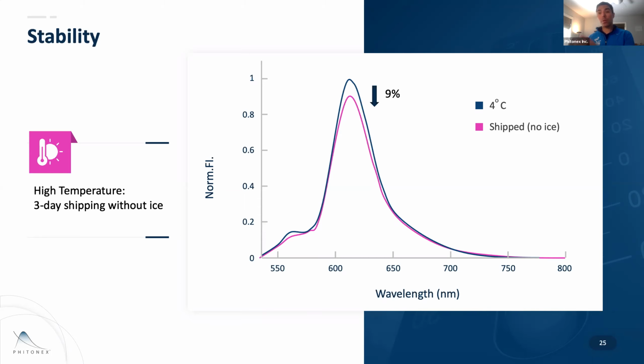And then the third was people running longitudinal studies, really wanting to say, how consistent is this over time? What does that mean in terms of stability? What does this mean in terms of fixation? And can I run things later? Something that becomes an acute issue when we've got limited access to instruments.